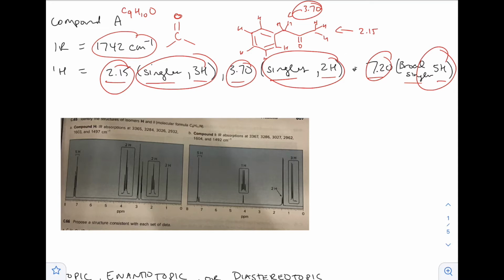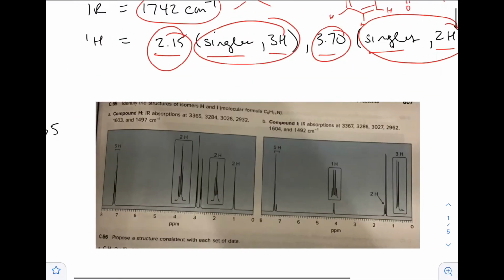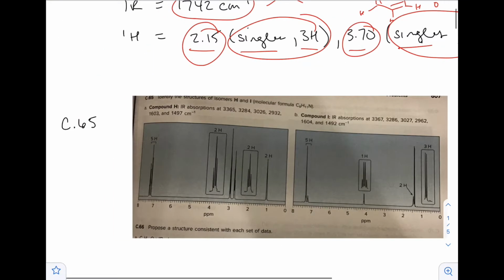I'll give you some info on how to help with determining or approximating chemical shifts a little bit later in this. I wrote some stuff down ahead of time to make it easier to go through. So this one right here, I also said I would do: C8H11N.